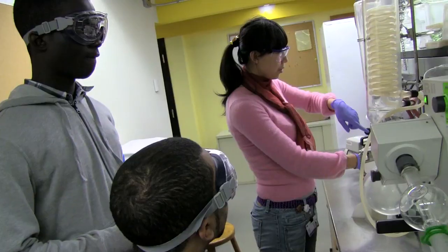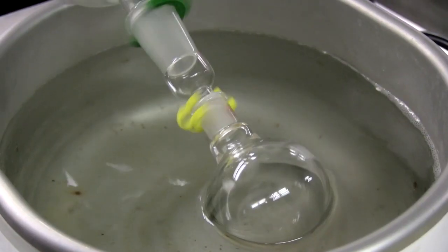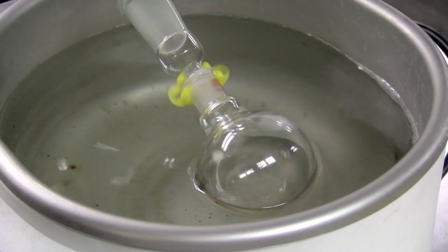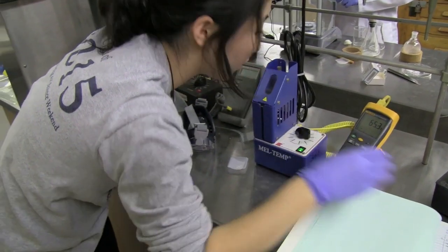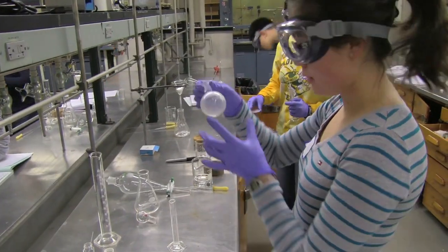She drained the solvent and then turned on the vacuum again. I still don't see anything. Everyone else was getting their samples and they were going to dry and then the mass, and I was like, I don't have anything.